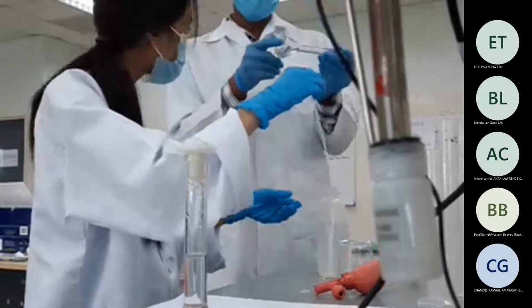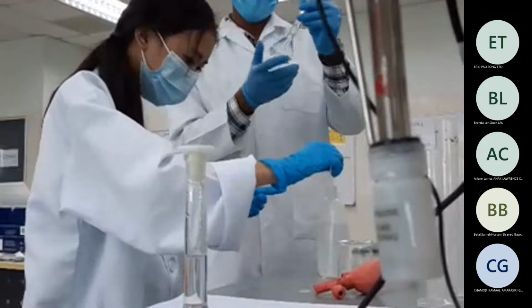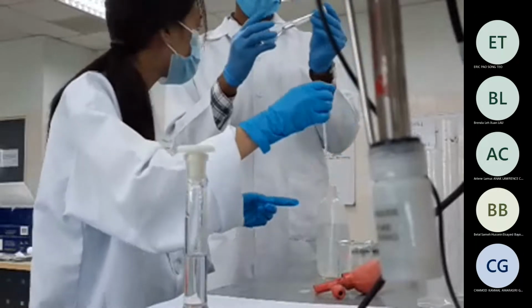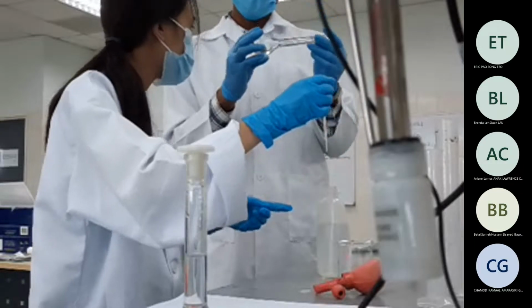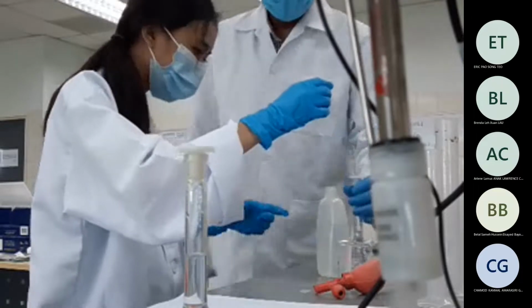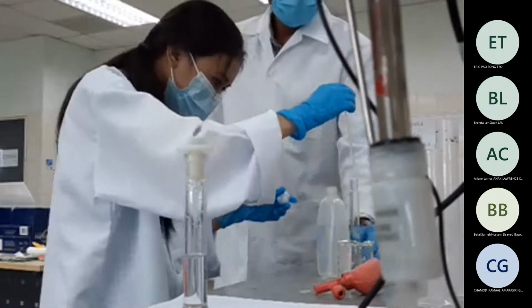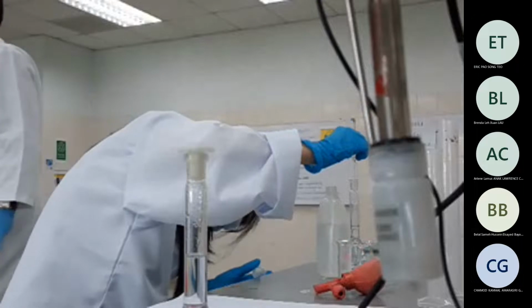Did you wash the glass? I mean the volumetric flask? Probably it is not very clean. You can see the oily substance. Anyway, so try to do. You have to bring your eyes to the level. Yeah, done?